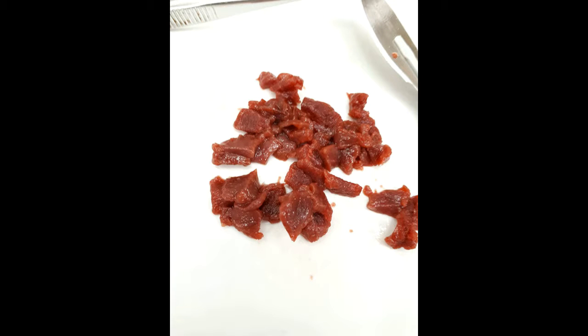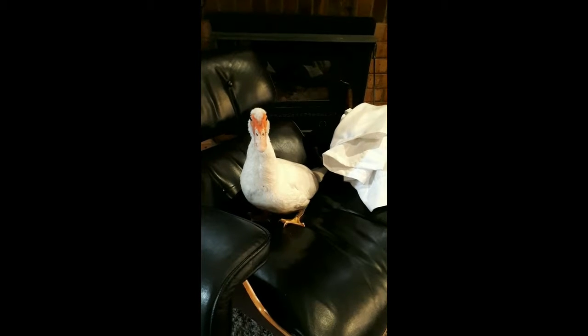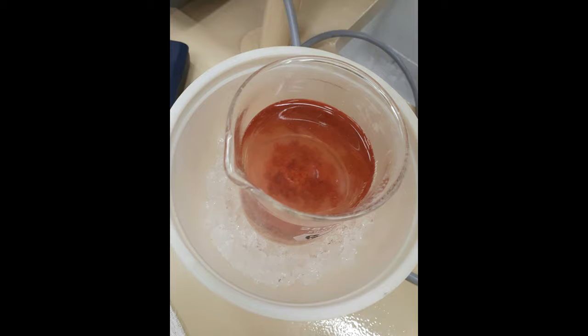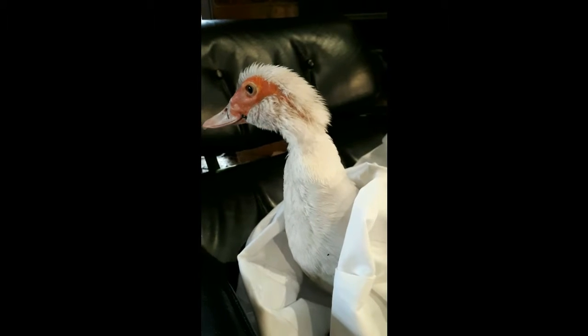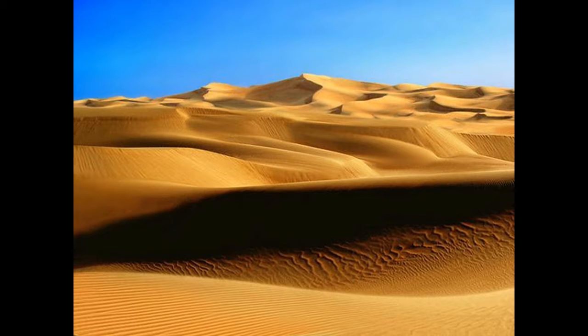To prepare the heart extract, we start with 5 grams of heart muscle freshly obtained from an unwilling sacrifice. The heart is then sliced and diced with a scalpel before being transferred to a beaker and washed with cold water 3 times. The heart mince was then poured over a muslin cloth, retained, and squeezed to remove any excess fluid. Then we transferred the mince into an ice-cold mortar, chilled on more ice, and added 6 ml of ice-cold phosphate buffer and a teaspoon of the finest Arabian sand.